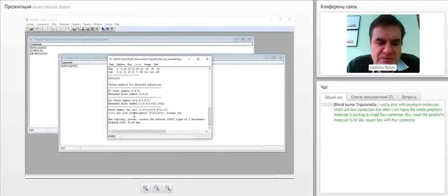And the second way that is possible now, you can use the online version of the whole collection that is free of charge. And now the main purpose of our webinar is to get you acquainted with this part of our services. So we get the information that this topology is new, but we should check if it's really new using the whole version of the TTD.